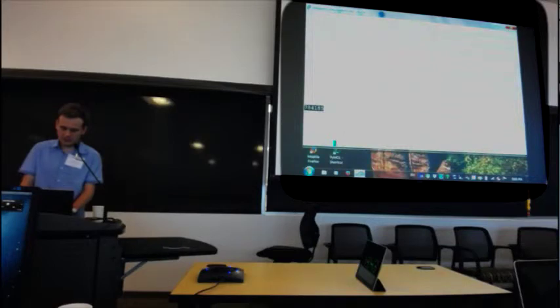Oh, cool. So we are using the bash, say source, to import those paths.